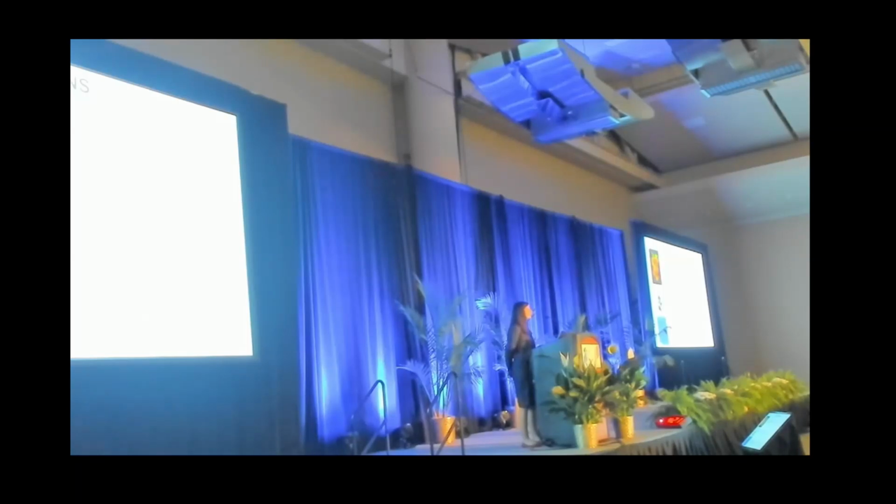Thank you. Hello, very nice talk. In the first part of your talk, you mentioned how you can use these 3D tomography images to identify the changes in the cobalt size and distribution.